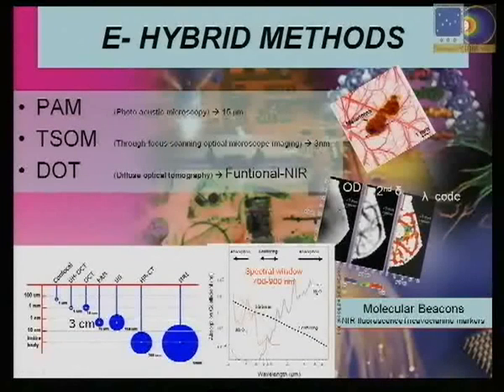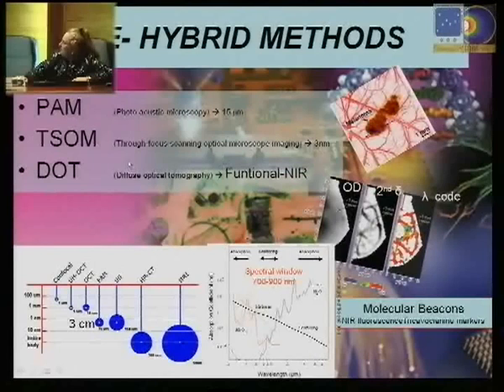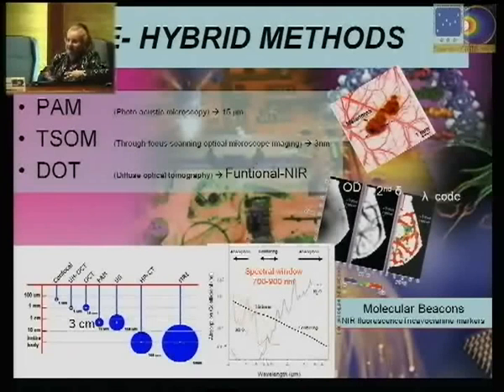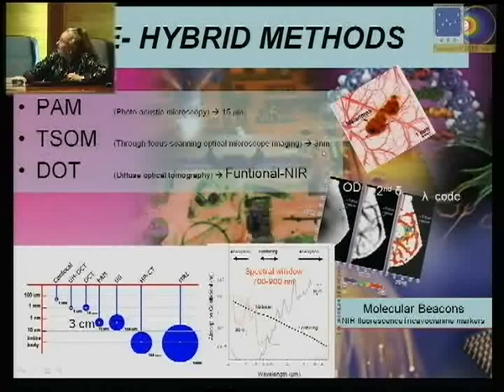So you can detect things which are very, very small. This is the through-focus scanning optical microscope imaging. It's just subtracting images at different Z positions. Obviously with a very nice and very precise scanning system on Z position, but it's, let's say, a very stupid method, and they get very good results.